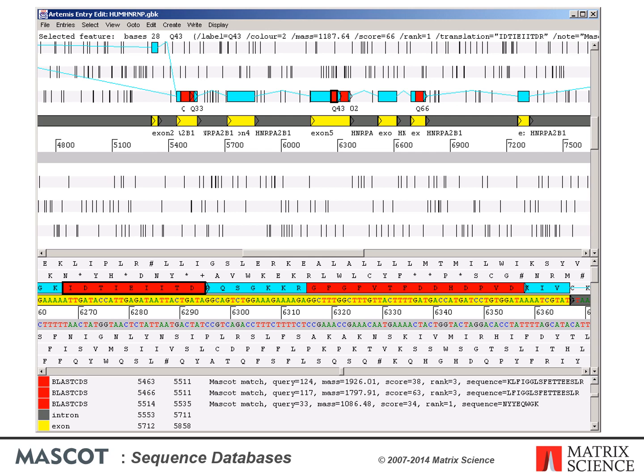The middle third is a similar arrangement, but at high enough resolution to see individual bases and residues. And finally, the lower third shows a tabular view of the feature table. When a match is selected, it is highlighted in all 3 views, and we can see the spectrum number, sequence, molecular weight, Mascot score, etc. Not only does this allow us to zoom and pan around these extremely long sequences, it also allows us to view the peptide matches found by Mascot in the context of all the existing annotations. This gives us a powerful way to present the results of MS-based searching of complete genomes.